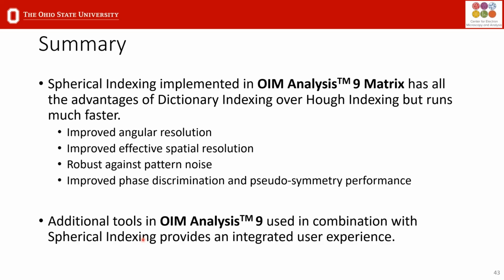And then if you take an SEM image or a transmission STEM image, you can import that image into the software and register it so that it lines up with the orientation information, to then plot these different kinds of information over each other. So that really facilitates the correlative techniques that you can get from these modern instruments.